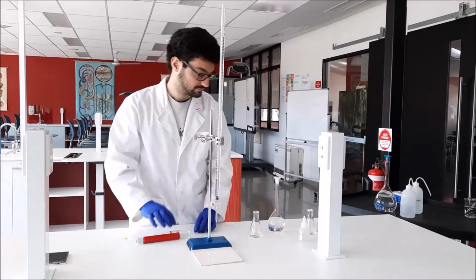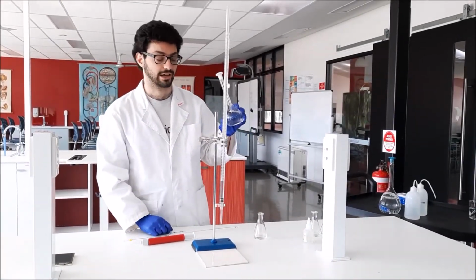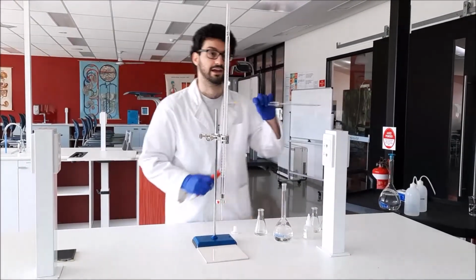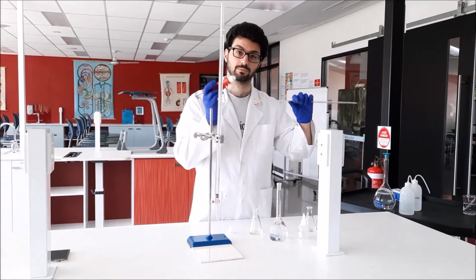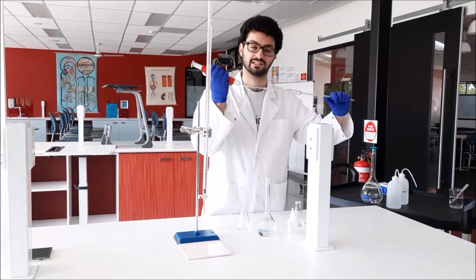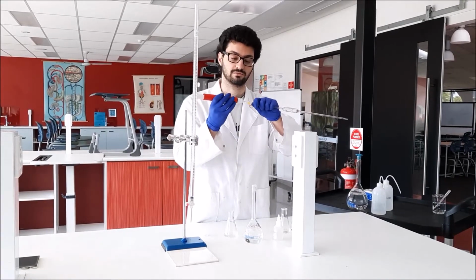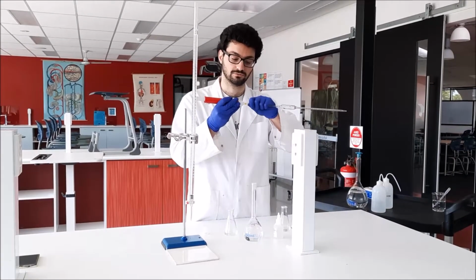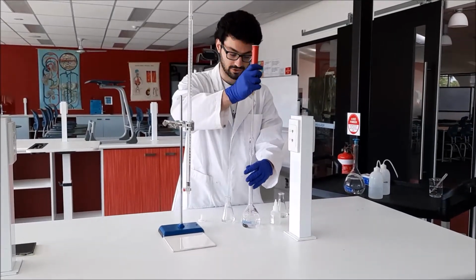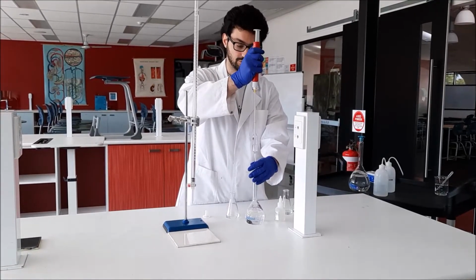So to do that, we've got our made up solution of our hydrochloric acid, and all we need to do is place our pipette into our pipette filler. Now, please be careful with these. If you're holding them end to end like this, what generally happens is they snap somewhere in the middle and you'll end up stabbing yourself. So make sure you're holding it down towards the end, push it into the hole, place it into your volumetric flask, and literally suck up your solution.